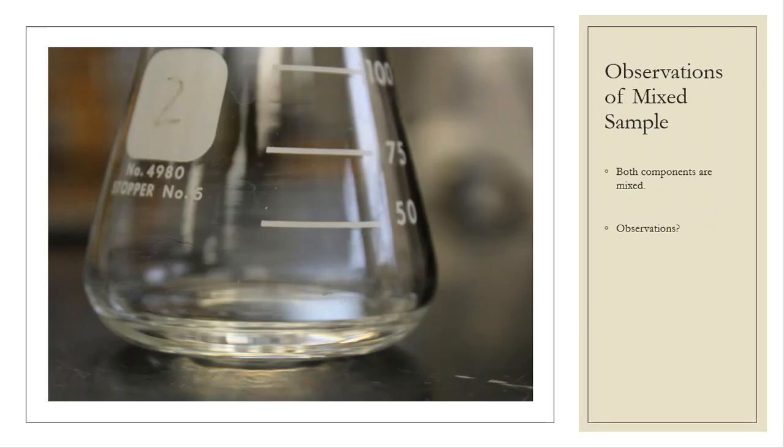So this is the image of the flask after those 2 alkanes, and they are alkanes. They were all single bonds. So those 2 alkanes were mixed together, and there's your observations. So if you need to make observations of the mixture, there you go. Now this is before the urea is added. It's before the methanol is added, of course. These are just the 2 alkanes that are mixed together with each other. So if you do need those observations, there you go. That's what they look like.